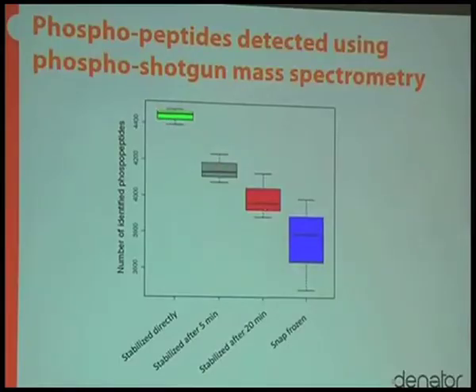So anything which is less has probably, with time, changed from its original composition, and this change is a removal of phosphorylations. So this tells us that a sample with fewer phosphorylations is further from the original in vivo situation compared to what we have over here, which is sort of the original. Maybe one could have detected 5,000 phosphorylations, for example. That's impossible to know. So this is a pre-study.